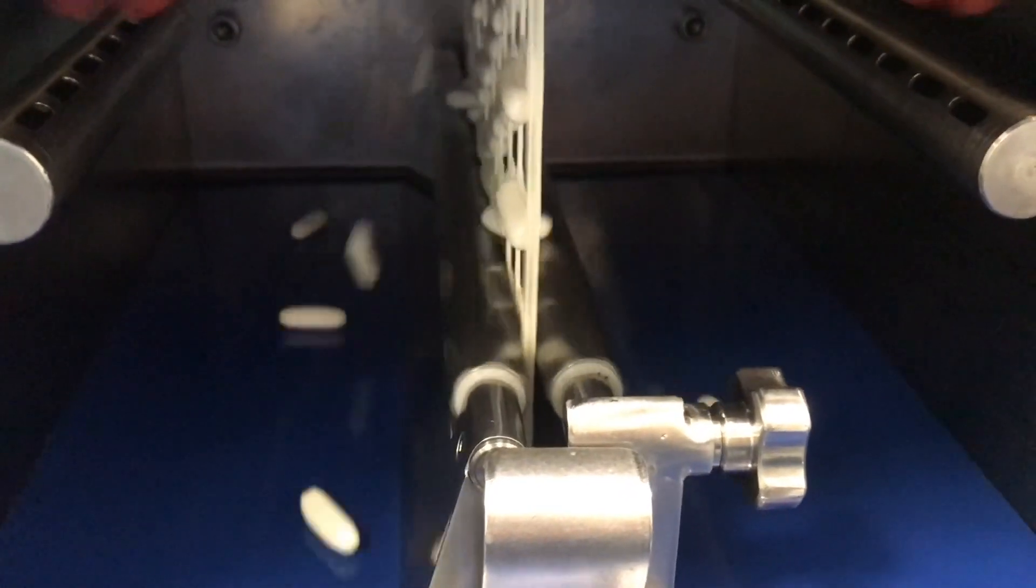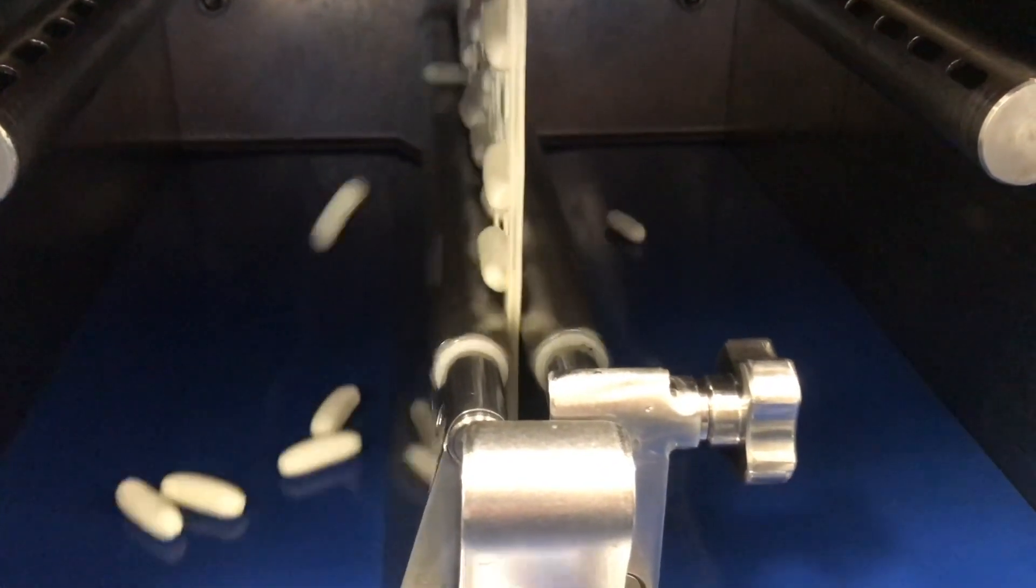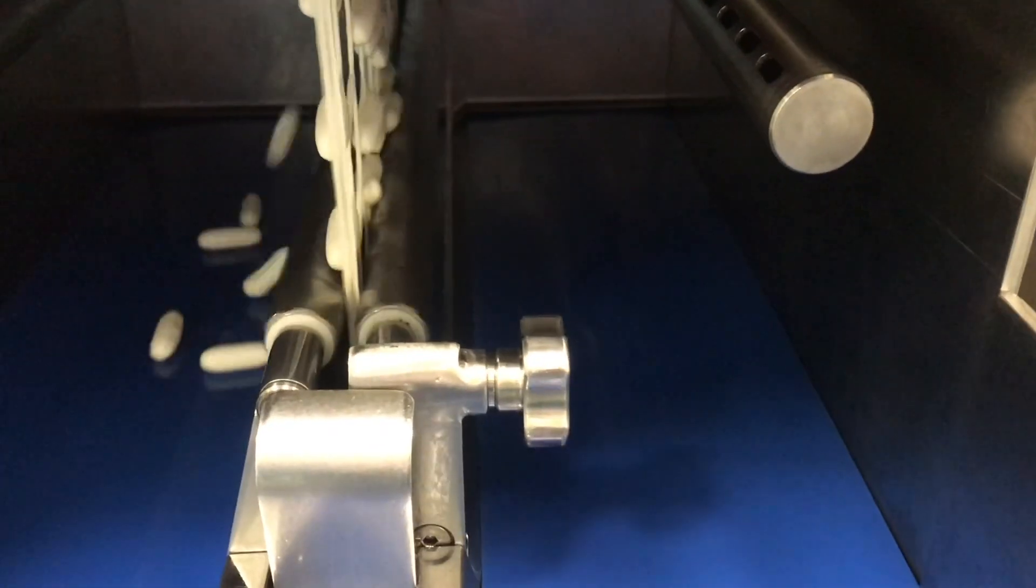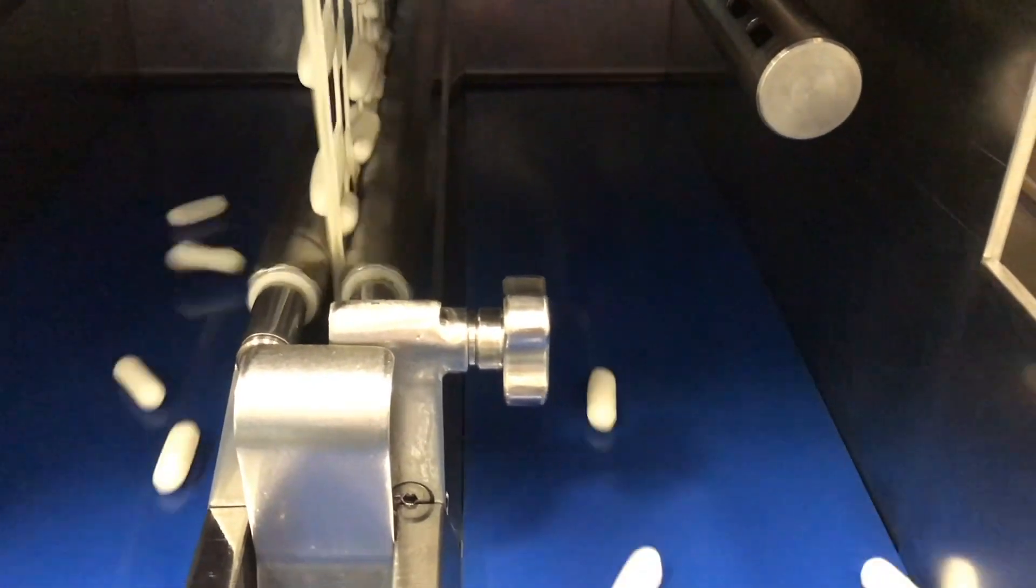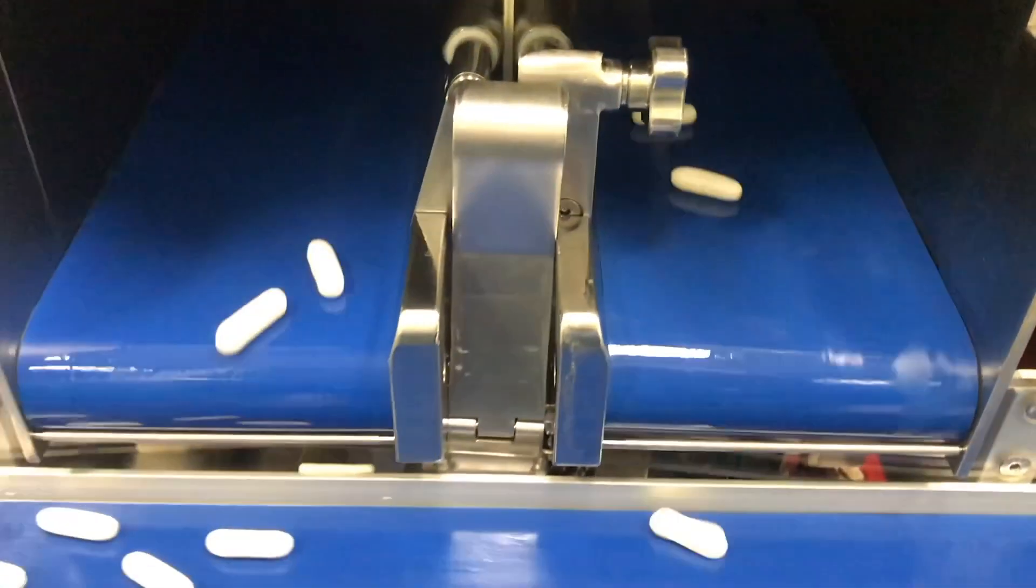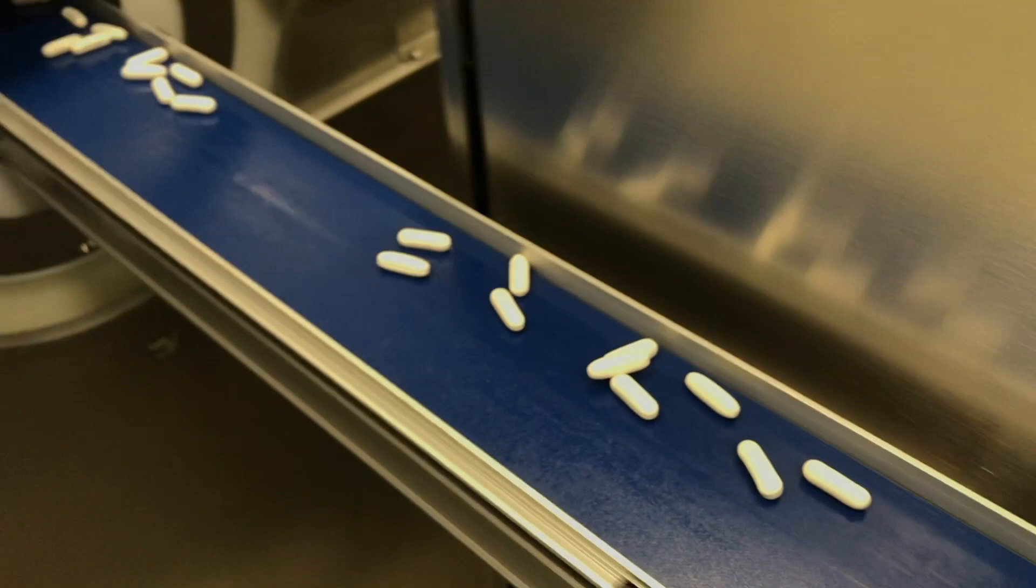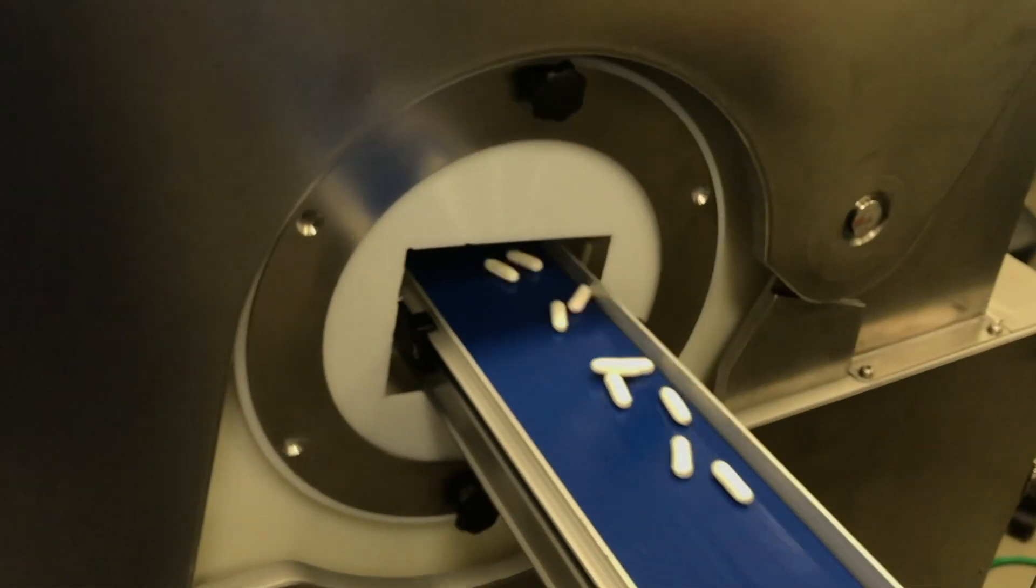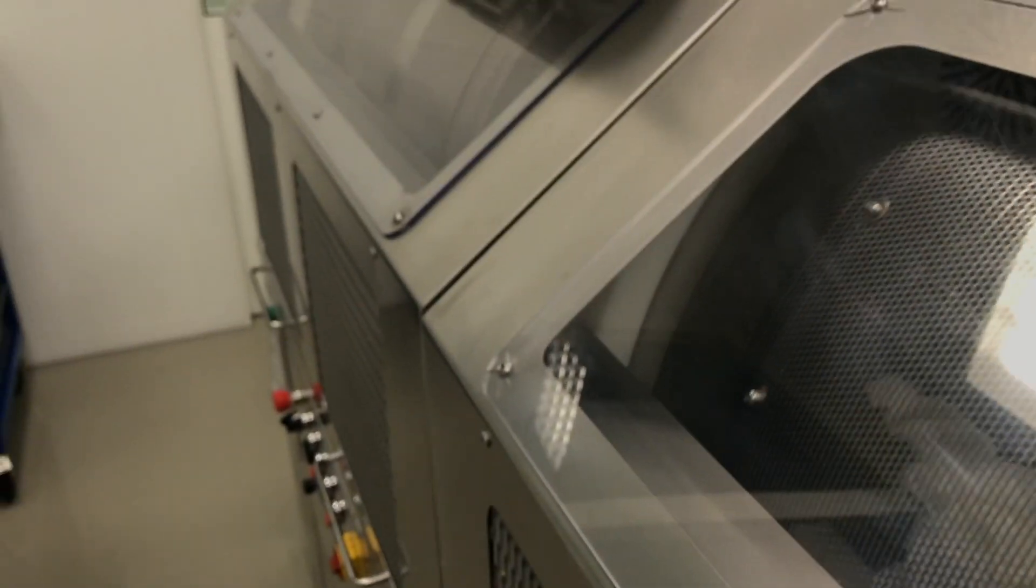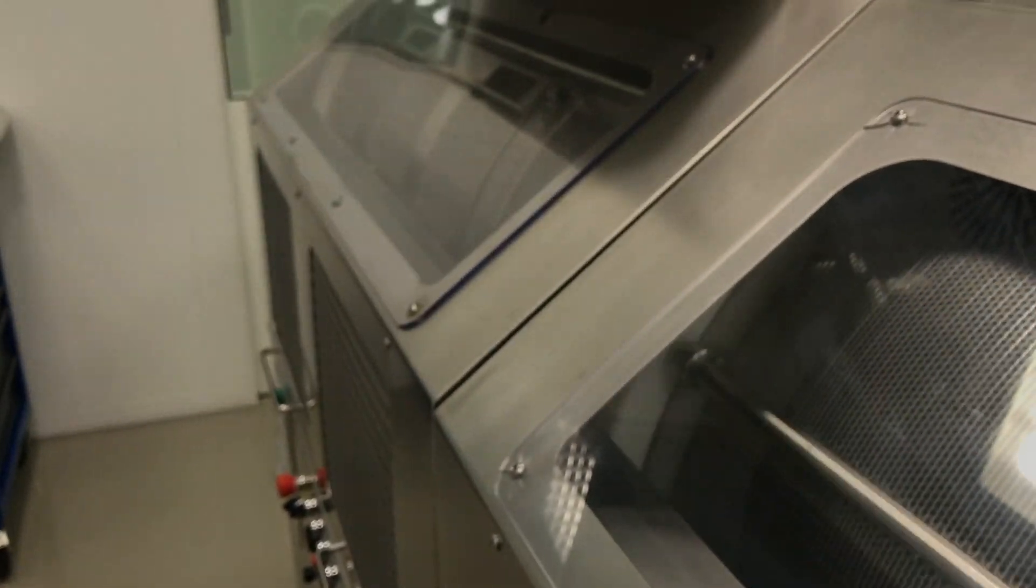Then on the conveyor belt they're transferred further to the rotating perforated tumbler for pre-drying. And this tumbler already has a couple of towels to remove the excess lubricant. After that, the drying step is continued in a conditioned room at specified conditions, like I mentioned, 10 to 30 or 40 percent relative humidity and typically approximately 20 to 25 degrees Celsius.